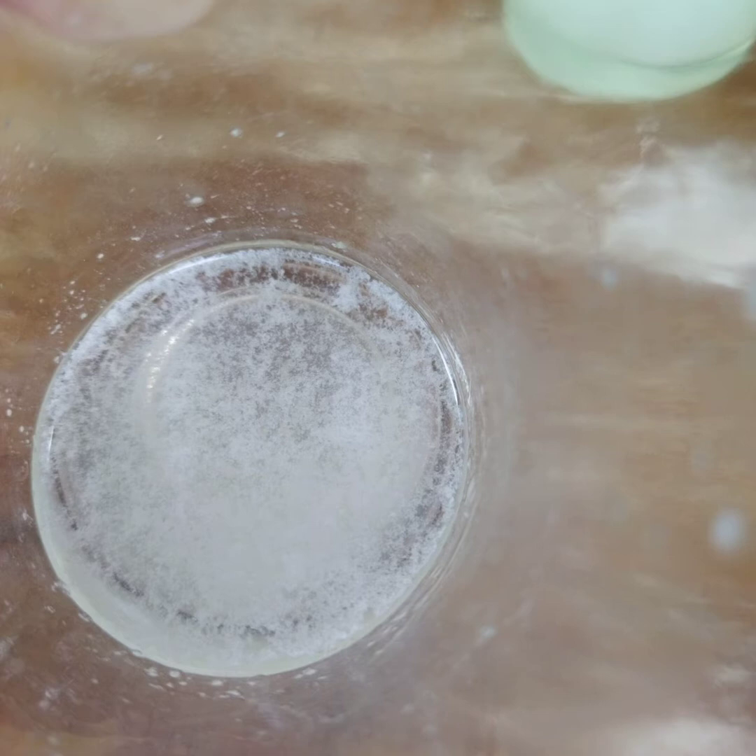After the addition of chilled alcohol, the DNA is isolated using a toothpick and transferred into a separate container.